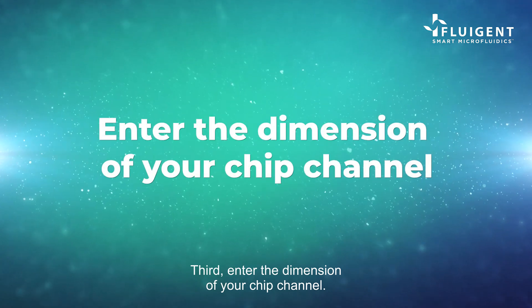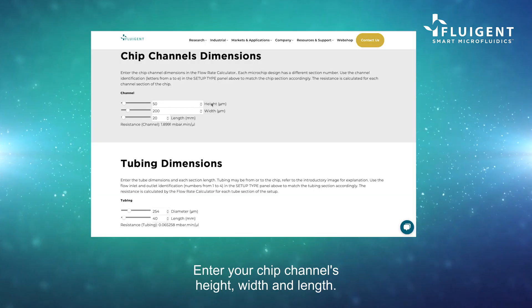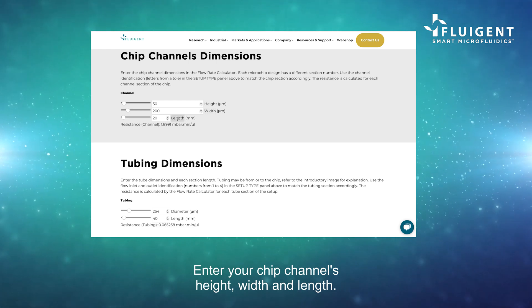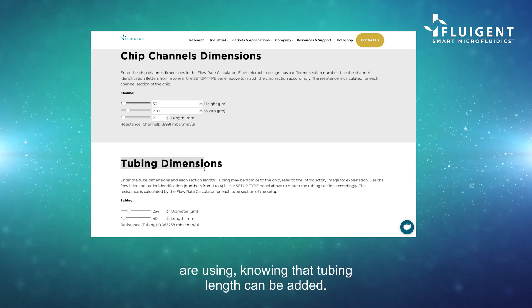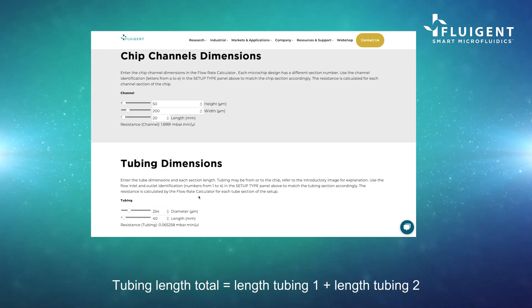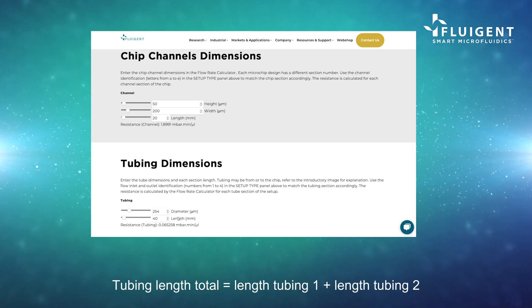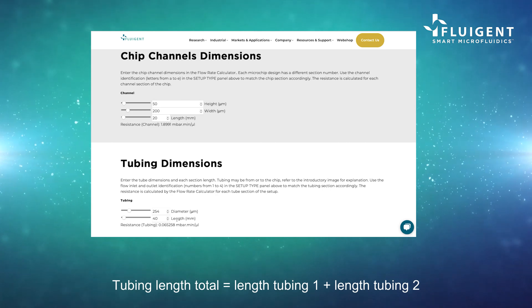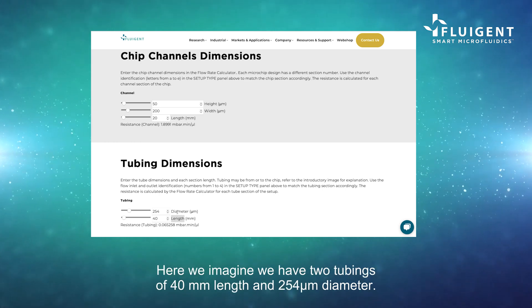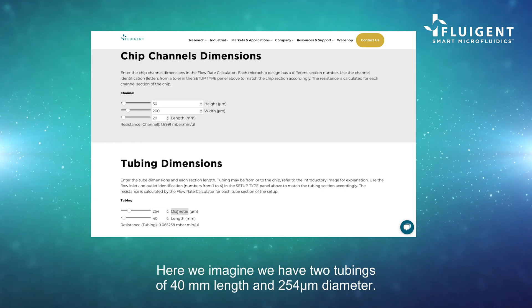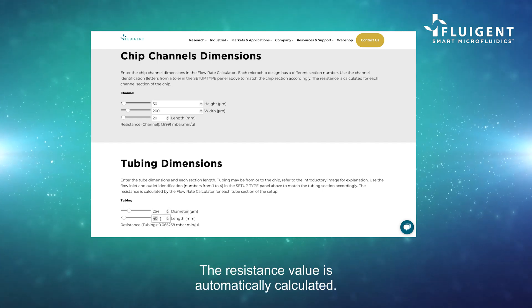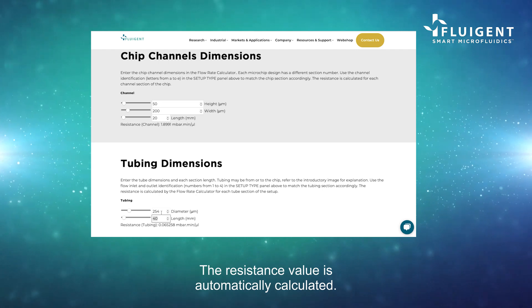Third, enter the dimension of your chip channel. Enter your chip channel's height, width, and length. Then, enter the dimension of the tubing you are using, knowing that tubing length can be added. Tubing length total equals length tubing one plus length tubing two. The internal diameter will remain the same. Here, we imagine we have two tubings of 40 millimeters length and 254 μm diameter. The resistance value is automatically calculated.